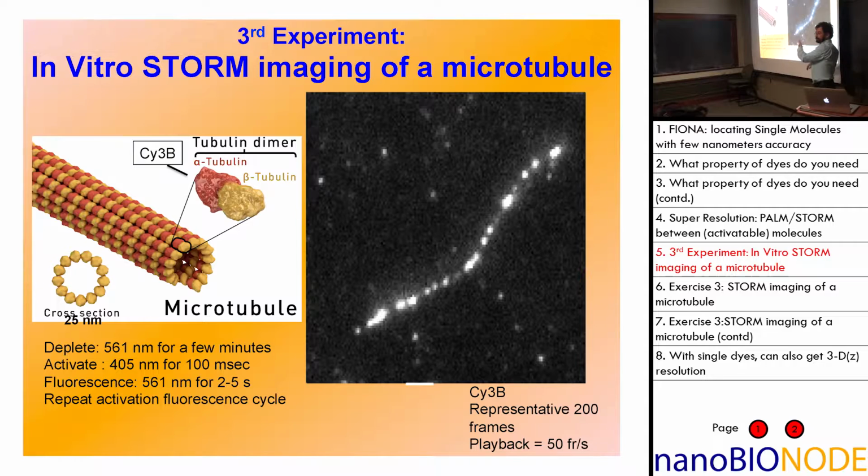You decrease the intensity, which? Is this the 561 nanometer or the 400 nanometer? The 400 nanometer. Because evidently, you're hitting it at 400 nanometers enough that both of them are coming on. So you just decrease it, and eventually, you'll see just one of them.